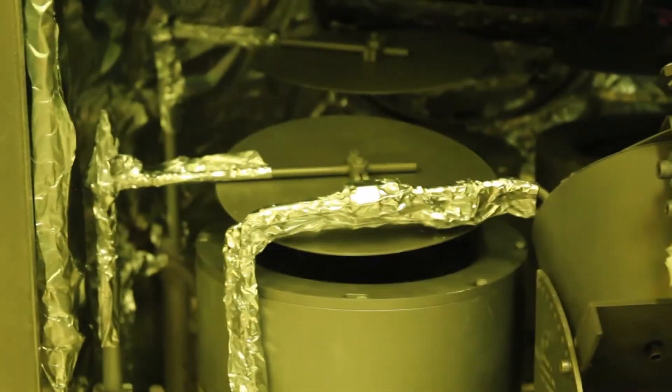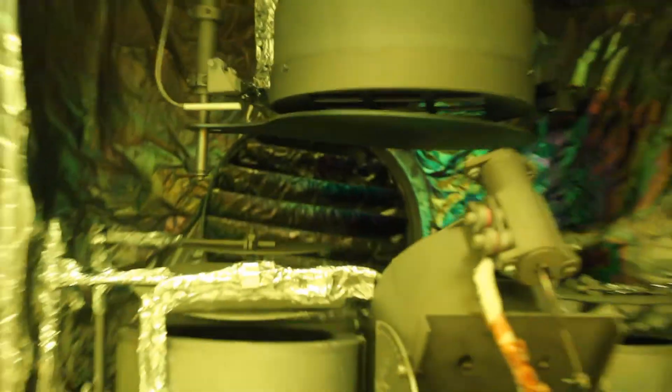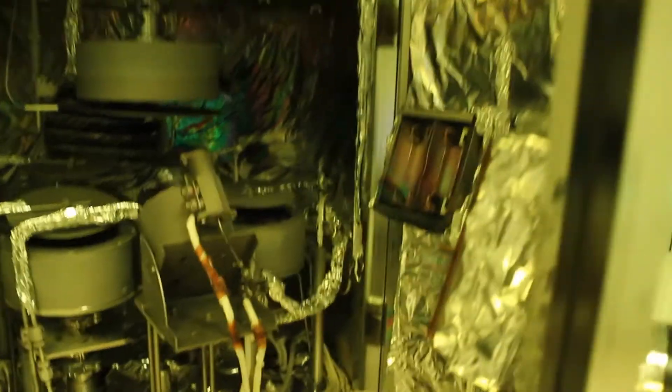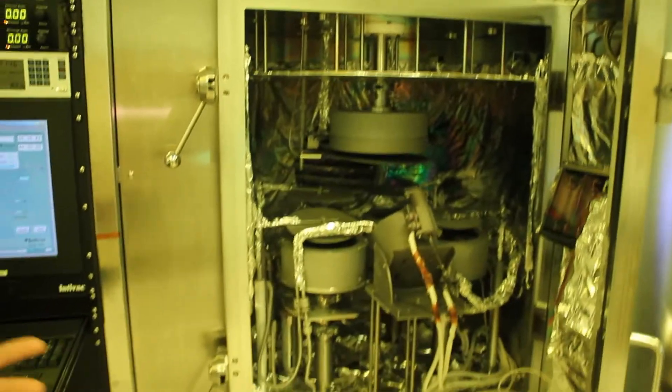Now the difference between the former system is that the targets here will be composed of very high purity metals and semiconductors. A few examples, for instance, we use silicon as a semiconductor and we can use aluminum, niobium, tantalum as the metal.